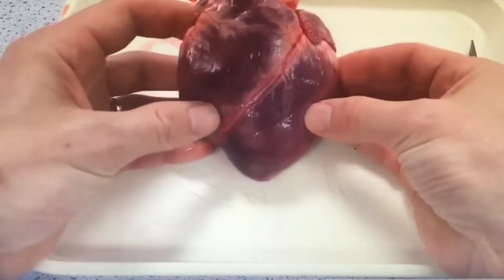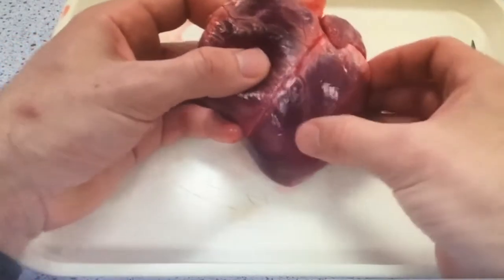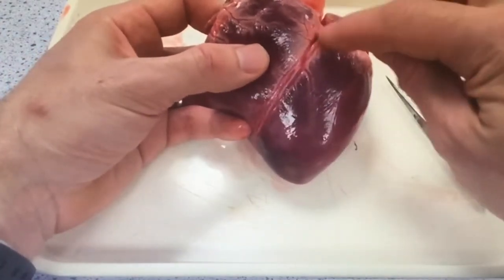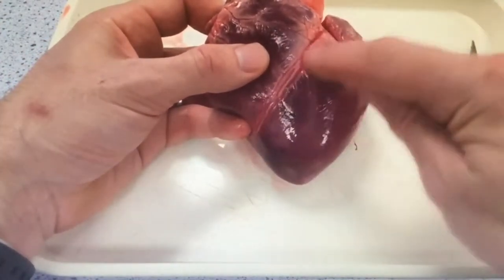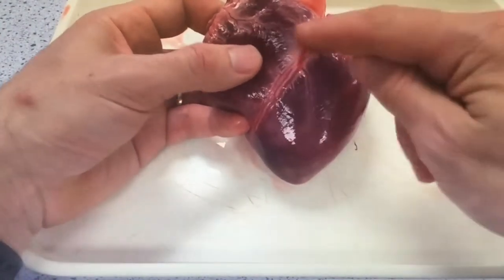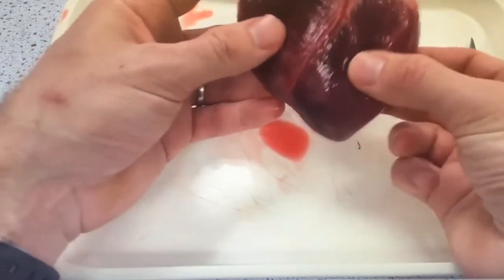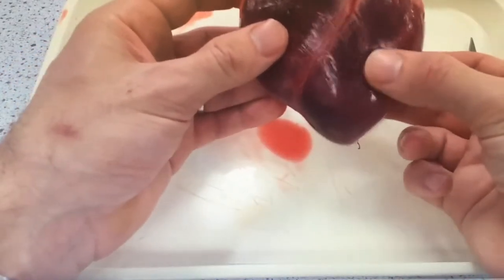The first thing you need to do is orientate the heart. You've got the left side of the heart on the right and the right side of the heart on the left, remembering you're talking about the heart as if it's your own. Orientate it so that the coronary artery runs from the top right corner down to the bottom left corner.